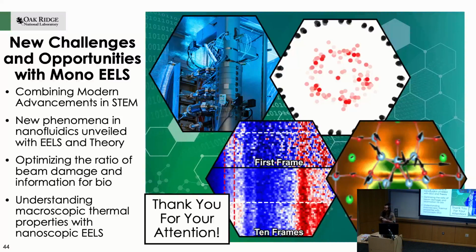These are still reasonably fresh, but I think this is probably one of the most promising applications of vibrational EELS I've seen. A lot of our initial work was all proof of principle experiments that said, hey, eventually we're going to learn something very interesting from this technique. This has been one of the first ones I've worked on where I feel like we are learning something very interesting from this technique. So I think it's very promising, and there's a lot of different things you could do with it. Essentially, the cross-section and measurability of the vibrational modes works out very nicely.